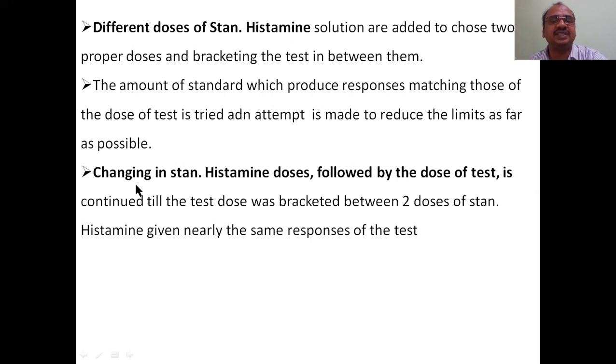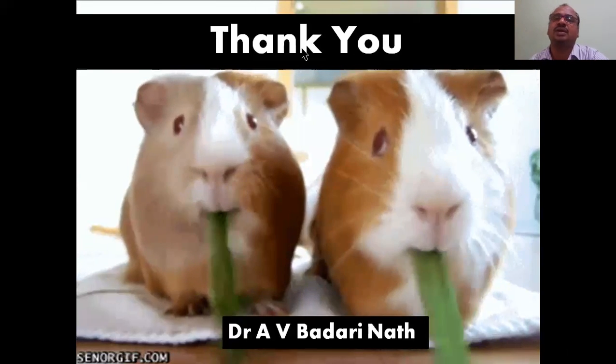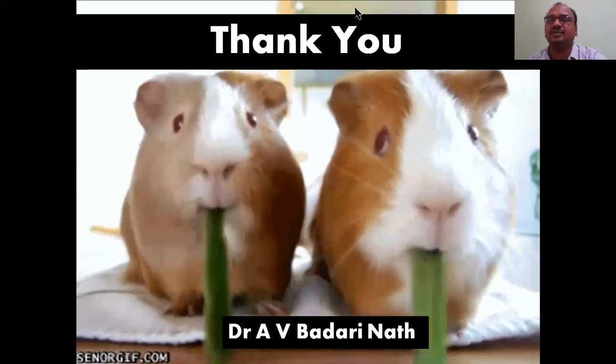You have to change the standard histamine doses, followed by the test dose. So that exactly you have to match the test solution with the standard. Like that you have to go on changing the standard, not the test. Test you should not change at any cost. Standard only you have to go on changing. Finally you have to match. Right? That is very simple, and you have to do it practically. Okay, thank you.